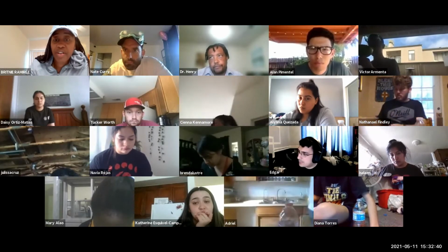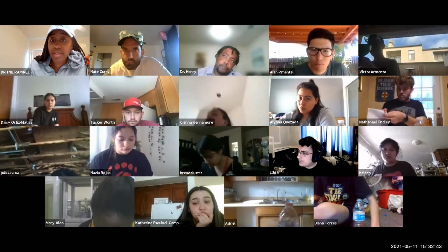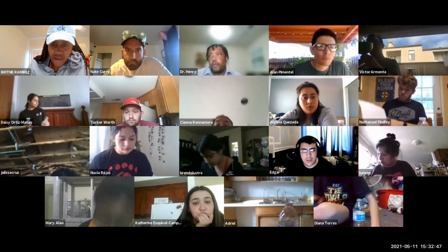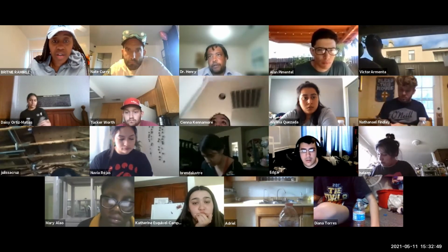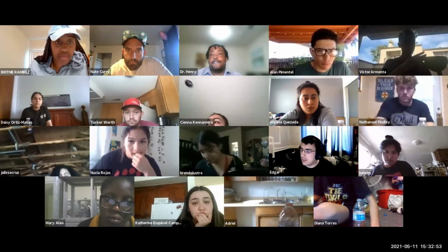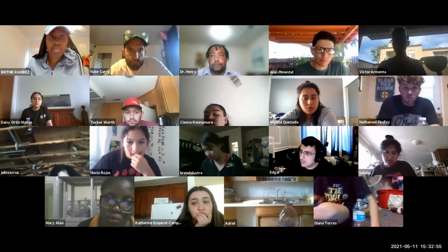Okay, so what I'm trying to figure out is, if you scroll up on the how-to in the module, it's saying about mass equals percent of Kool-Aid over. Yeah, because you're trying to calculate the percent mass. How much of the solution is Kool-Aid?